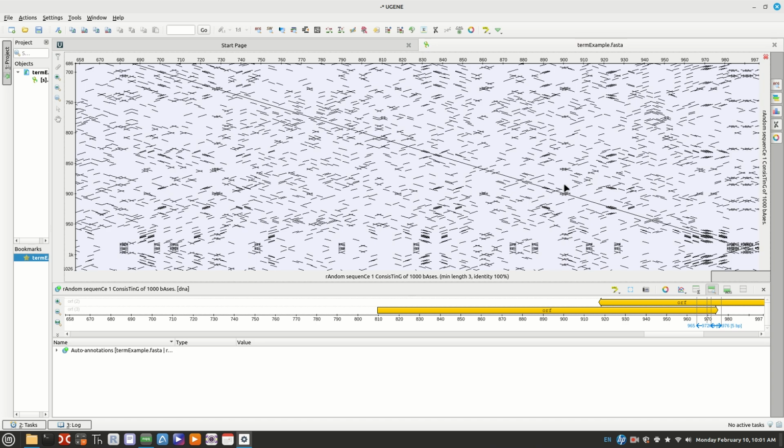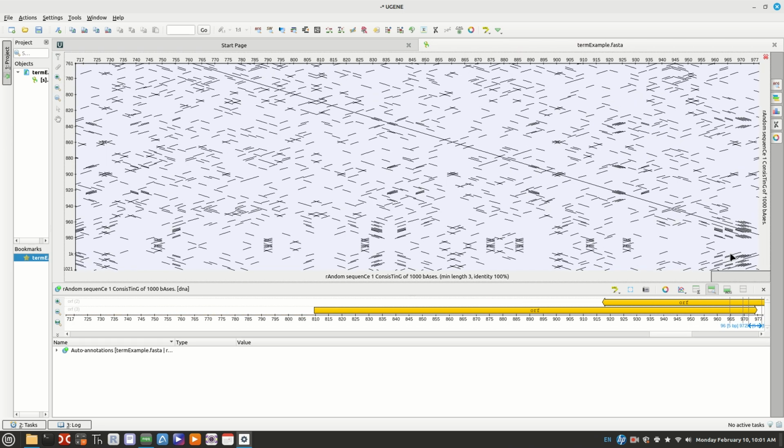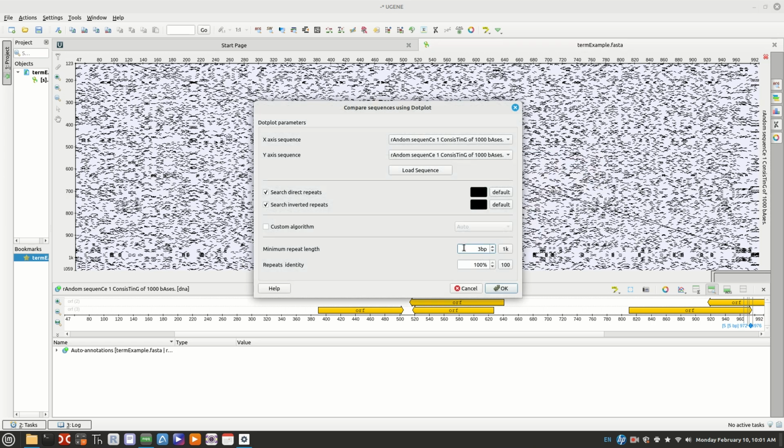This is a random sequence, which means you've minimized the amount of stuff out here that's going to match. And you can see we've still got a lot matching, and this is on a random sequence. It'll be much busier if you're comparing a regular gene. But you definitely get your patterns that you want, the T's crossing one another or the X's. It looks like the best number for this is 6 or 5 at about 80%.